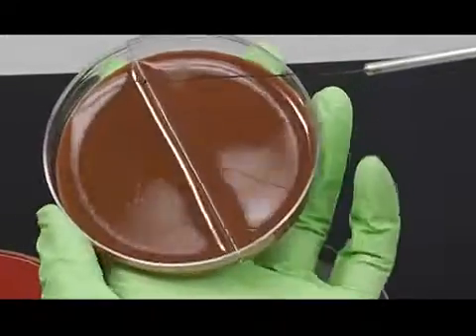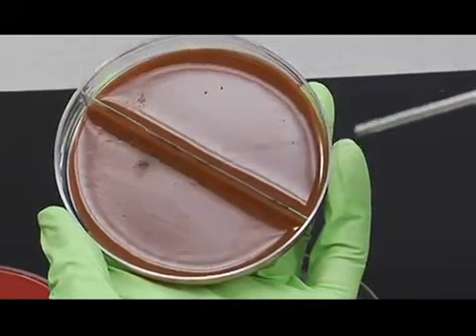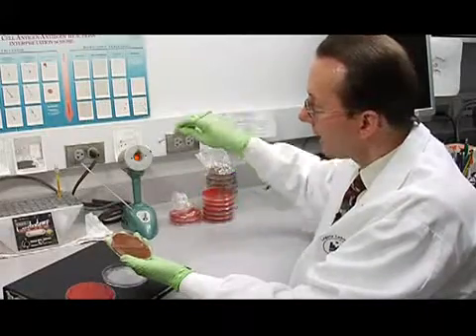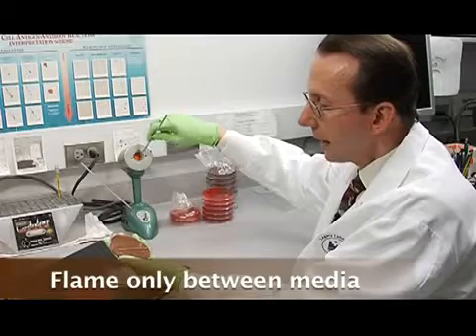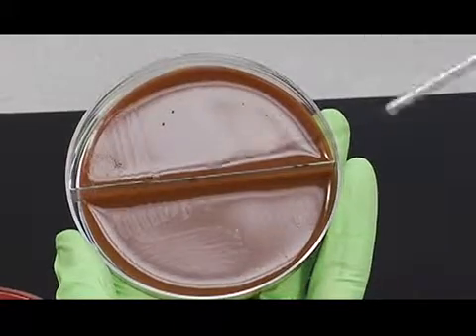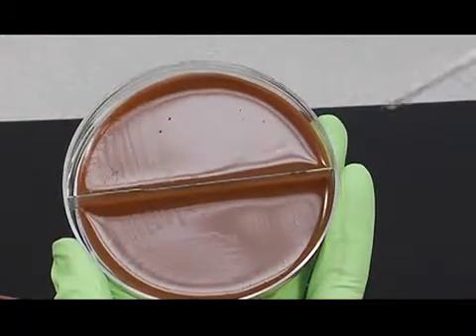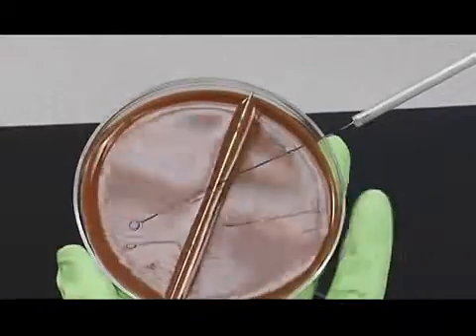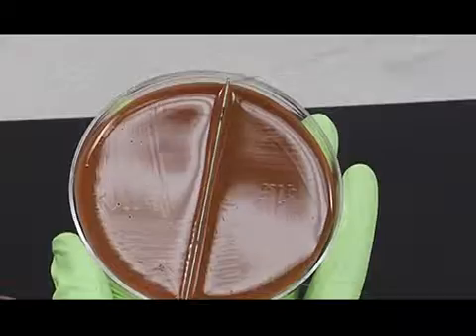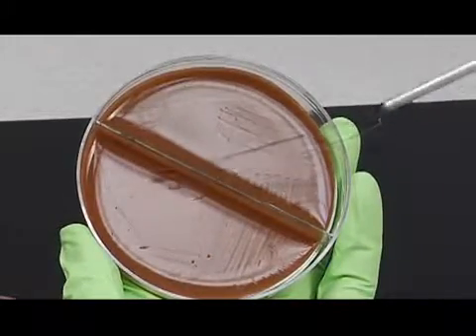So then you're going to take one swipe out from this area, then out into this corner, and then just streak it down like that. And when you've finished that side, flame your loop, and we'll go on to the next side. Streak out the inoculum. And then one streak out from here. Streak like that. And then for the final area, streak out into this corner and streak it down.